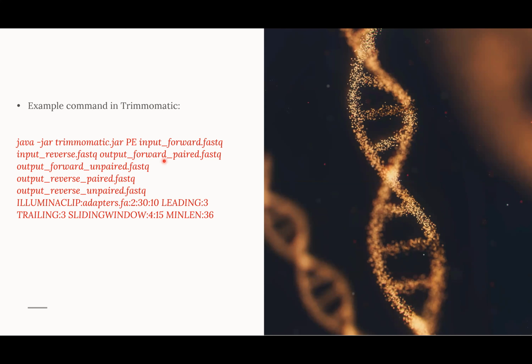So reverse means it's the opposite strand, and forward means it's the actual strand. Sorry, my biology is a bit rusty. Then you will run your command and it will output the trimmed reads. This is where you add the parameters that we discussed earlier, such as the stringency that you want the program to use while it's trimming your reads.